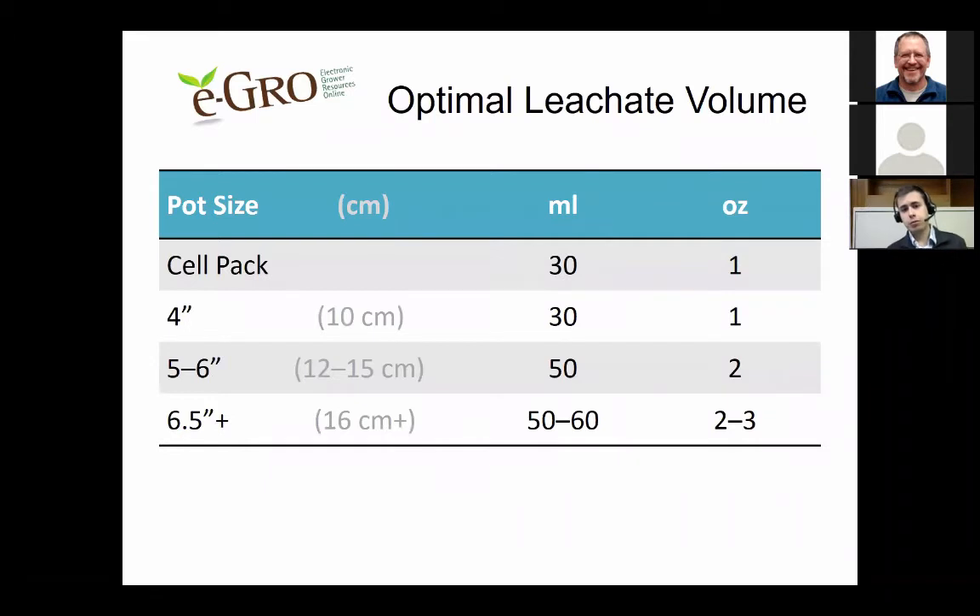Here are the optimal leachate volumes to collect: for a cell pack or four-inch pot, collect about 30 milliliters (one ounce) — roughly the same amount as what you put in. For a five to six-inch pot, collect about 50 milliliters (two ounces). For a six-and-a-half-inch or larger pot, collect about 50 to 60 milliliters (two to three ounces).